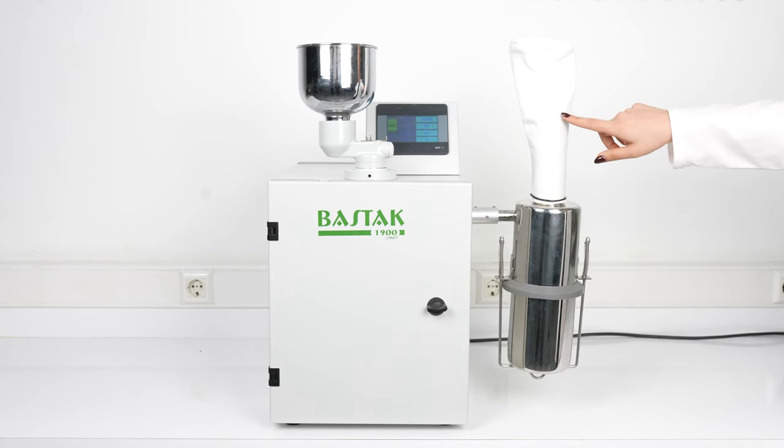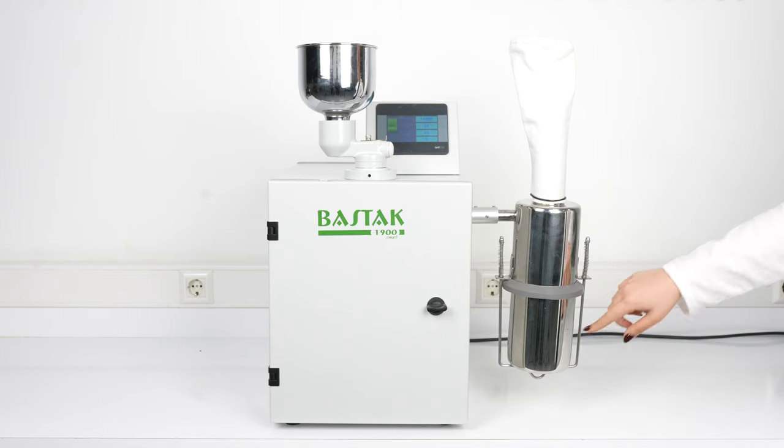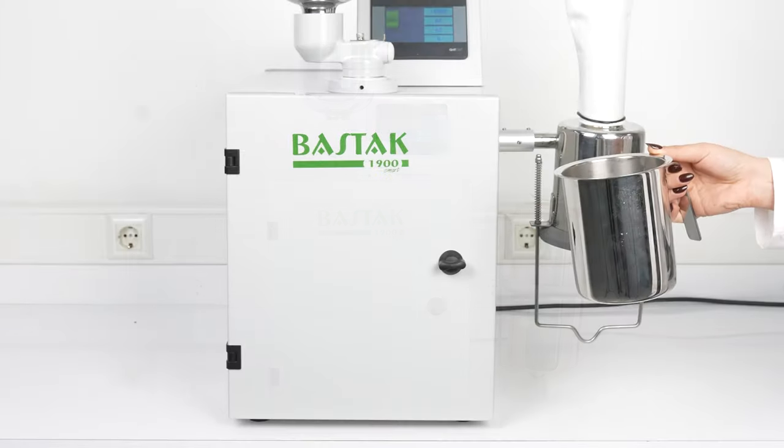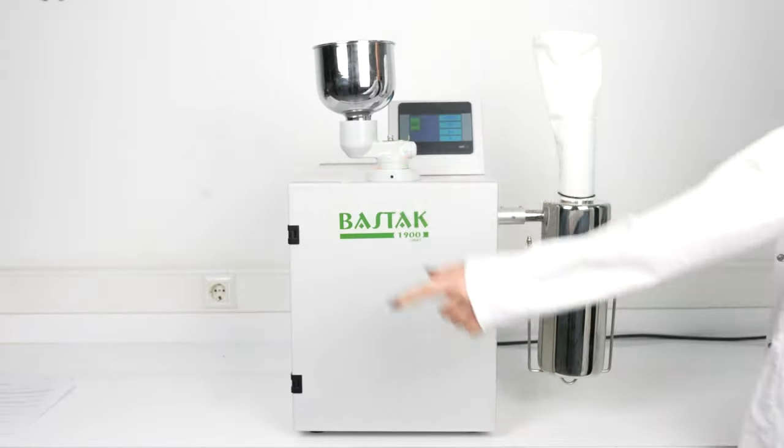The dust filter prevents dust formed during grinding from being released into the atmosphere and allows air to be thrown out. The cyclone container provides air intake during the grinding of the sample. The sample collection container is a cylindrical container in which milled wheat, corn, soybean, industrial raw materials, grains, oil seeds, and legumes are collected after the grinding process. The sample collection container is fully inserted into its slot with the help of springs.